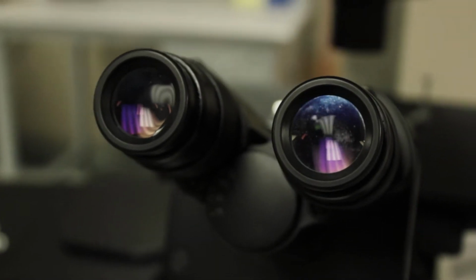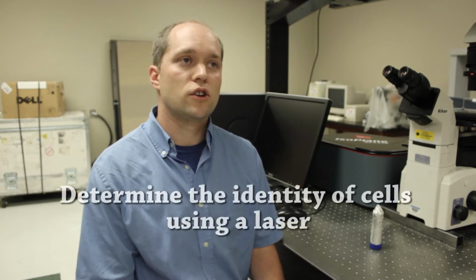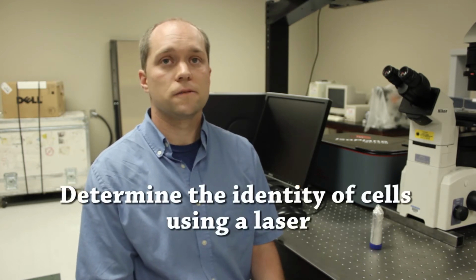There are methods such as immunohistochemistry, where you're actually placing a stain on the cancer cells, and you have to allow the stain to incubate, and it's expensive and time-consuming. Using Raman spectroscopy, you can just shine a laser at the cells that you're interested in, and based on the reflections of that laser, you can determine the identity of those cells.